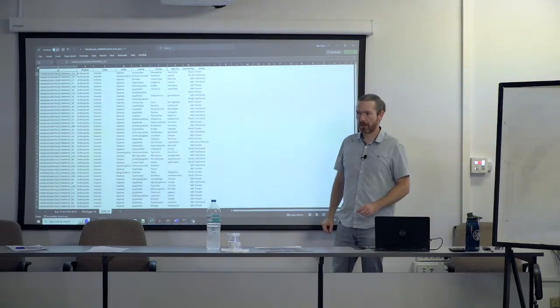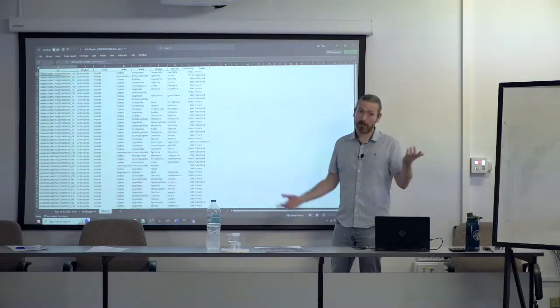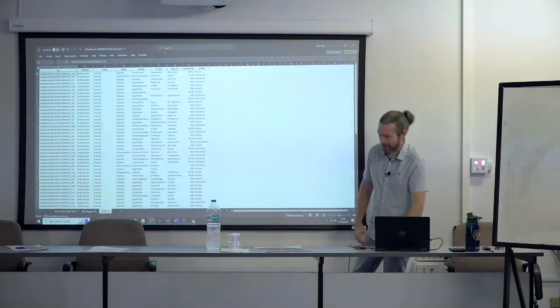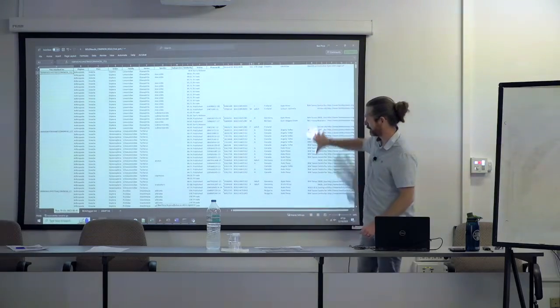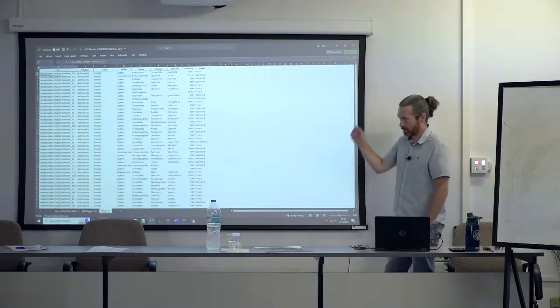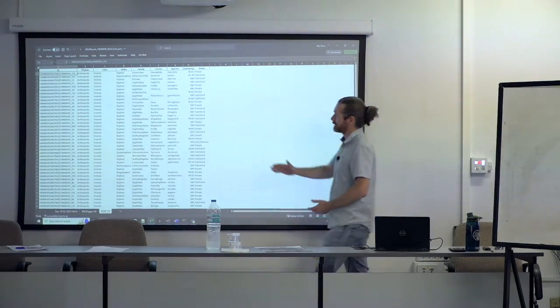Not with BOLD Digger. I think it's just the top 20. Yeah. The command line might have additional options. Yeah. So yeah, that's the output. 20 for each record with all the additional data here. So if you say, I want the JAMP pipeline to go through those different thresholds, it does that for you.